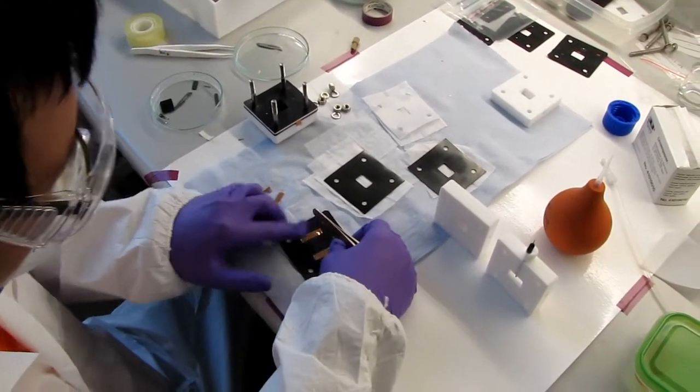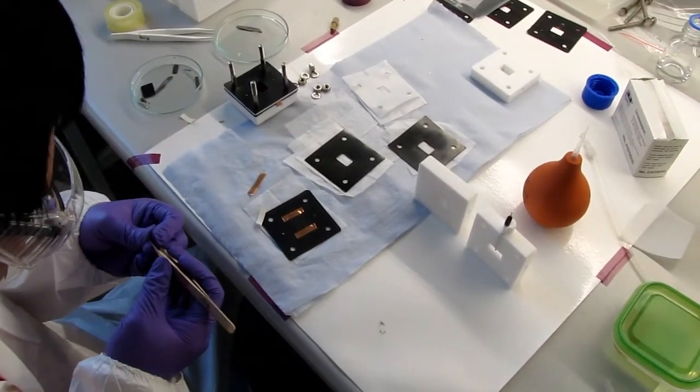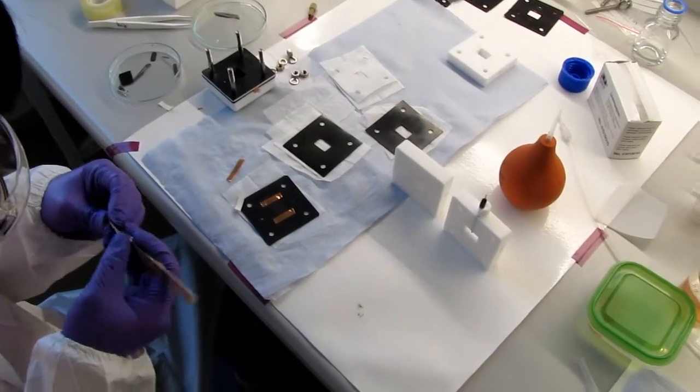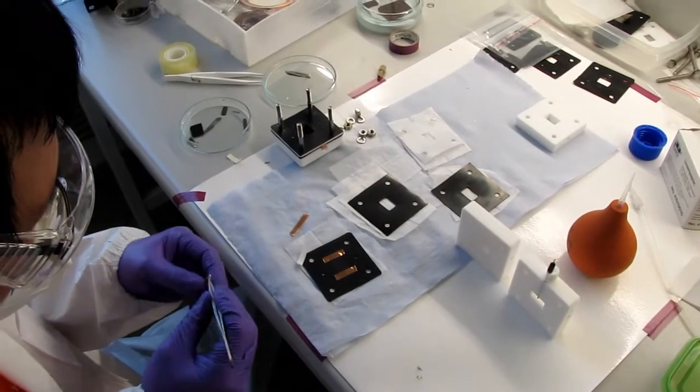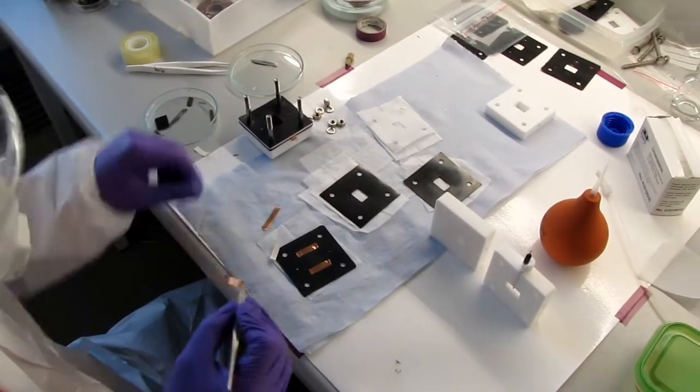You also haven't seen my cell before. No, not really seen the real one. Exactly, yeah. It's super simple stuff. Was this also what Sebastian worked on? Yeah, so far it's good, but their disadvantage is the voltage. The cell voltage is slightly high.